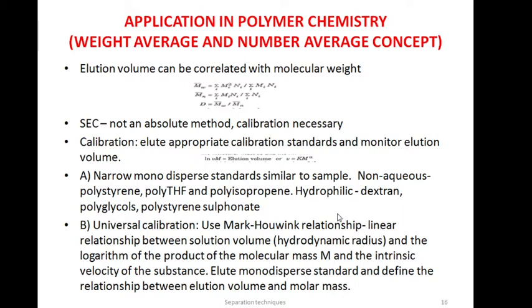In another synthesis you have synthesized molecular weights 25, 50 and 100. So you can't say that both of them are the same, right? They are going to vary. When they are varying, you cannot say this method is absolute. You cannot say that this much volume is going to give you this much molecular weight.